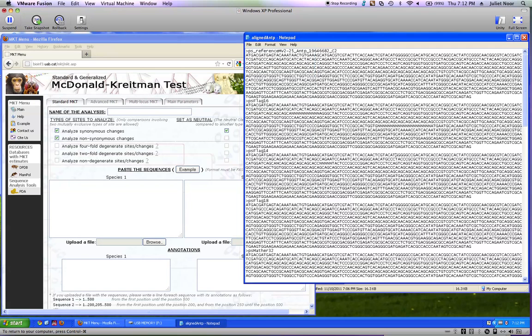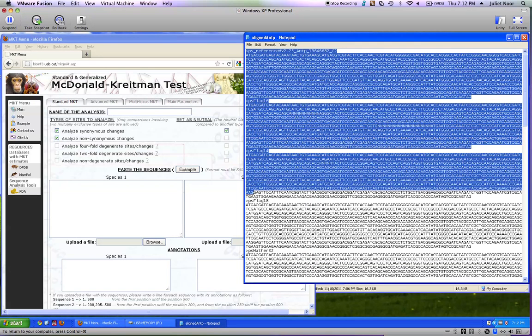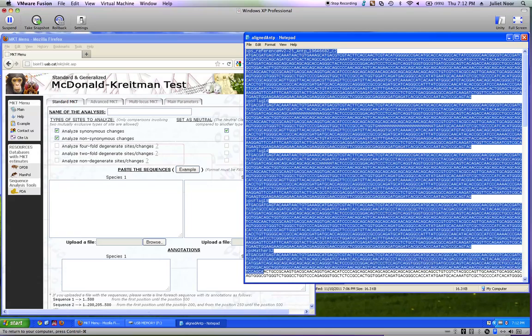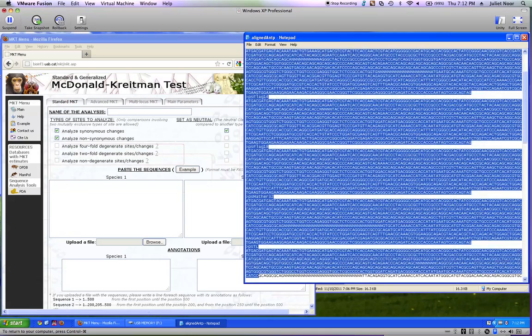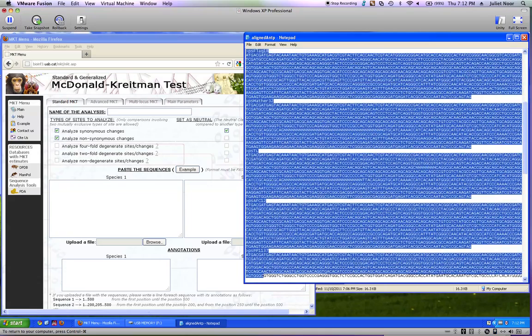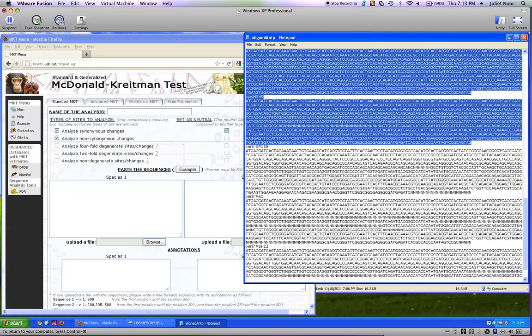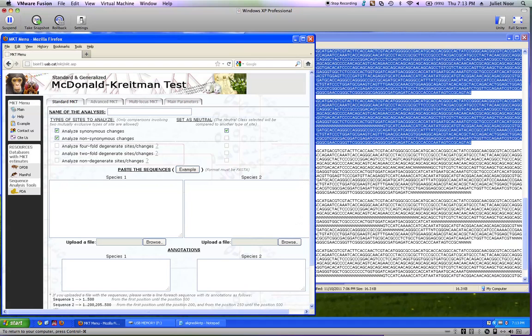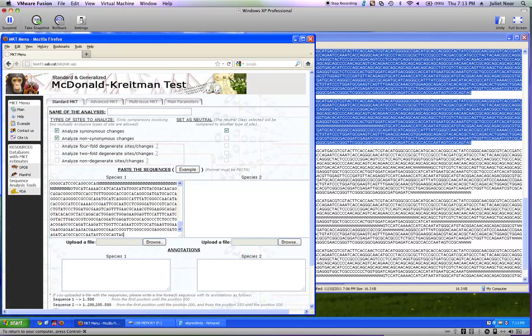I want to put all of the pseudo-obscura strain sequences in the box on the left under Species 1, and all the Miranda strains on the right under Species 2. Going back to Notepad, I select all the pseudo-obscura sequences by scrolling down and selecting them, then copy those.